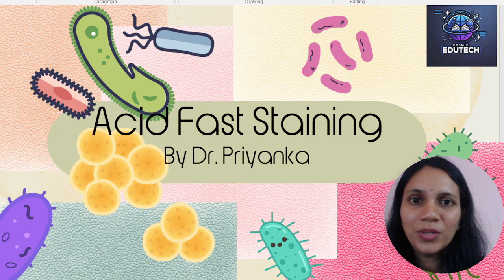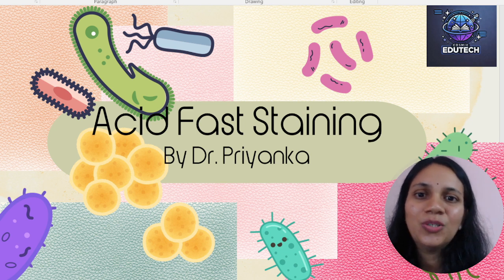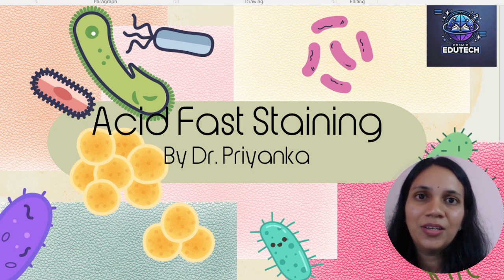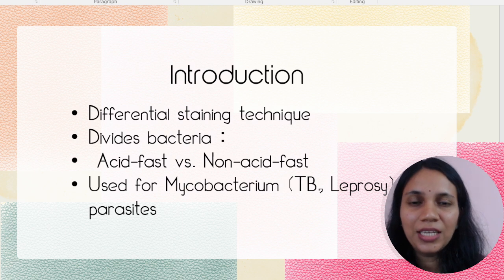So today I am here with yet another staining technique, that is acid fast staining, also known as Ziehl-Neelsen method. And today we will learn the principle, procedures, observations, applications and some easy tricks to remember this method. Now, this technique is very much crucial, especially in medical microbiology, in detecting mycobacterium, the causative agent of tuberculosis and leprosy. This acid fast staining is a differential technique used in medical microbiology.